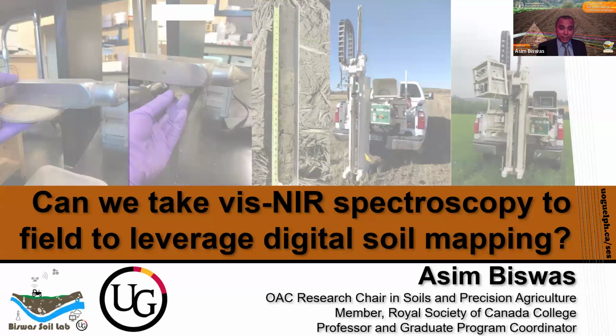If you ask me why I put this title, can you take vis-NIR spectroscopy to the field? Maybe. I don't know whether I will be able to definitively answer that today. And can we leverage those spectroscopy-collected data for digital soil mapping? Again, maybe. So what I would like to do is take you through some of the research projects we have been doing in our lab in Canada and in collaboration with many other countries as well.